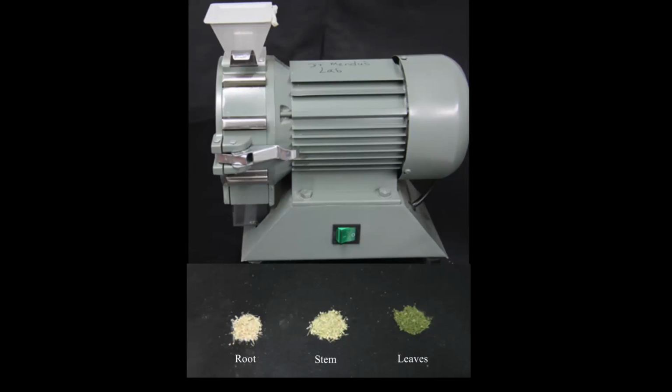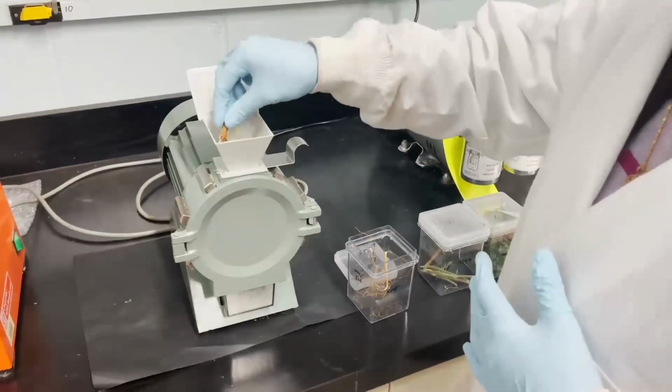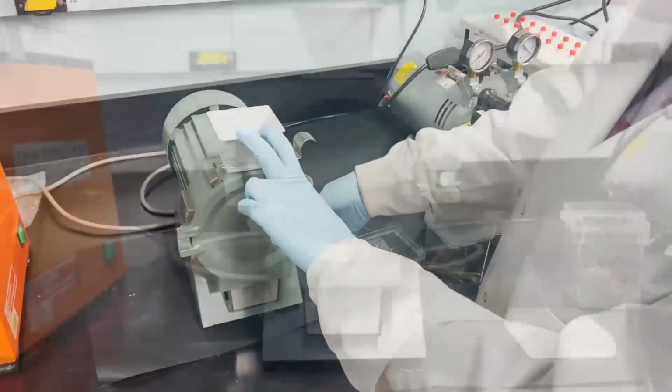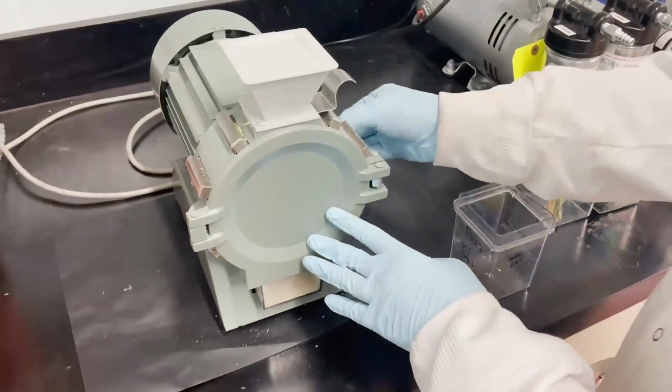Alternatively, a biomass grinder is used to crush the plant tissues. Use the root tissue. Turn on the biomass grinder. Collect the crushed powder into pre-labeled containers.